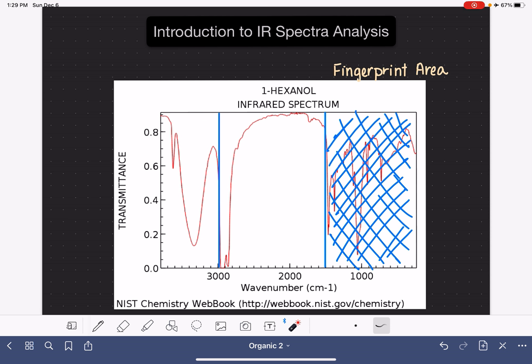But if we are just analyzing, like trying to understand what functional groups are in this molecule, if we're just analyzing, then usually the fingerprint area has way too much information. So we're going to ignore everything to the right of the 1500 line, and then now we're going to go over to this first area of the spectrum that I marked off, everything that is to the left of the 3000 wavenumber line.